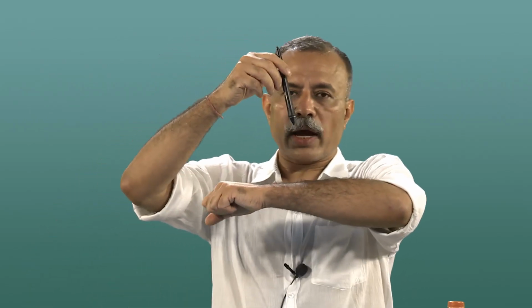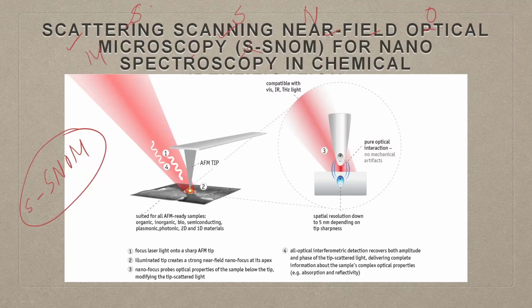When we are talking about putting a probe like this on a substrate, there is every possibility that you are disturbing some of the atoms and creating atomic vibrations. Apart from it, if you shine a laser onto the sample, you also can create such atomic vibrations, which is the basis of any form of spectroscopy.